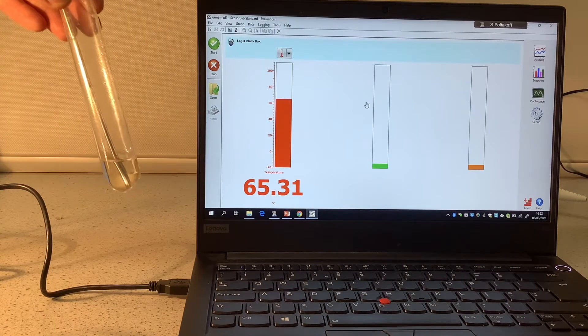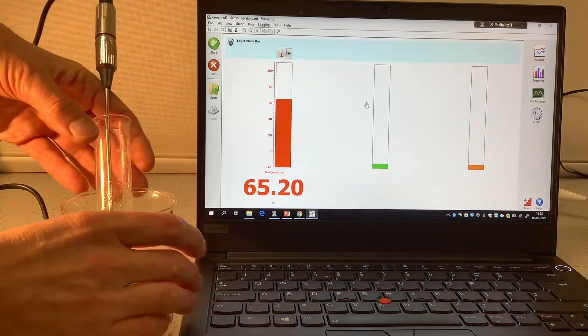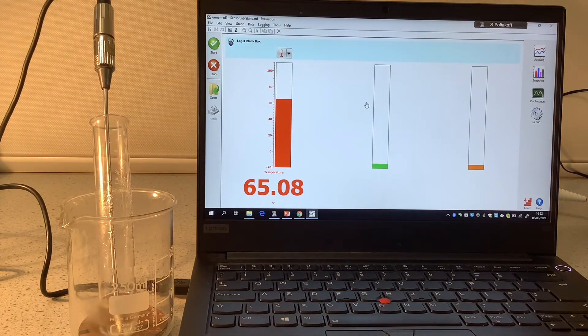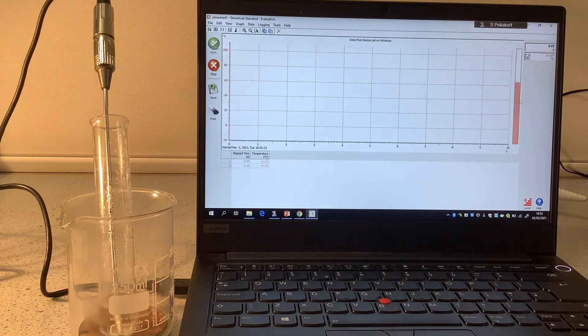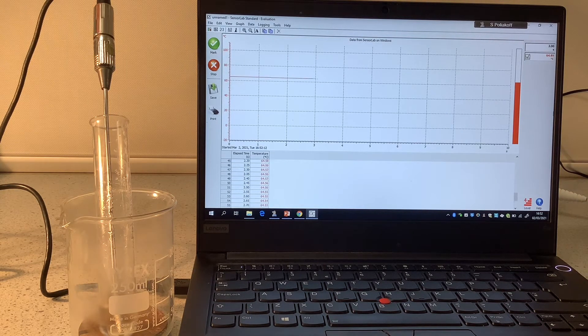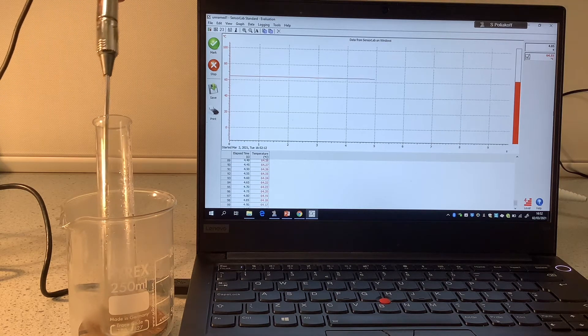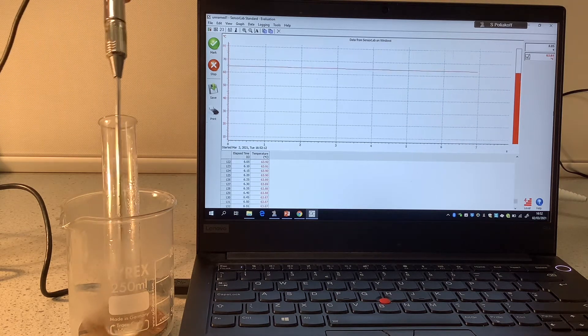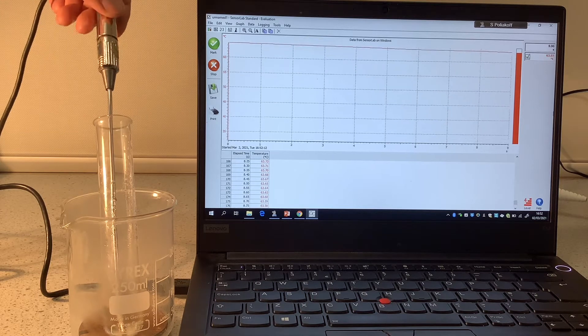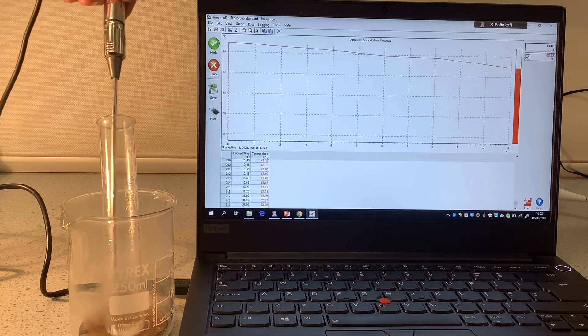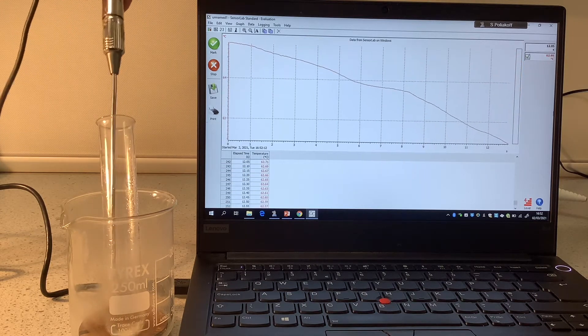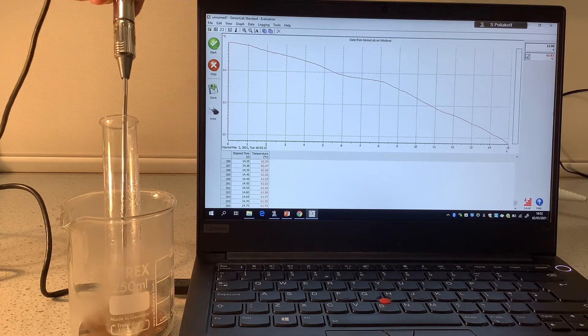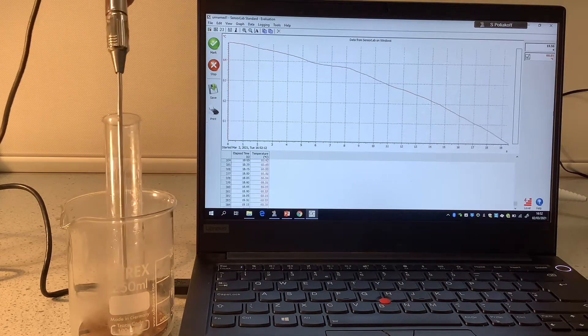So out that comes, pop it into that beaker and now I'm ready to start logging the temperature. And to make sure that it stays reasonably even temperature throughout, I'm going to keep stirring the stearic acid.